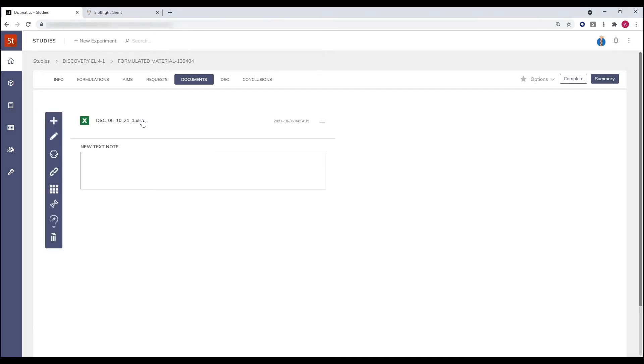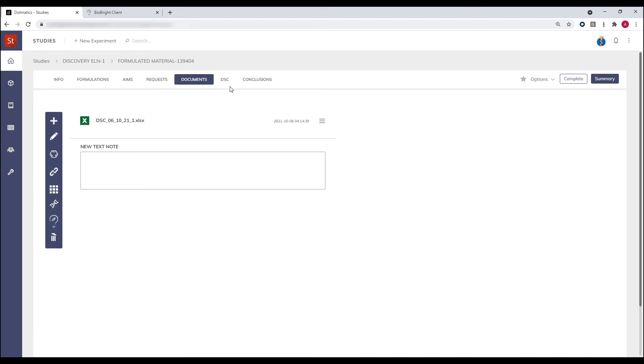We see the Excel file appearing directly into the experiment that I chose. In addition, all of the data within this Excel file has been parsed and stored directly within the database along with the file itself.